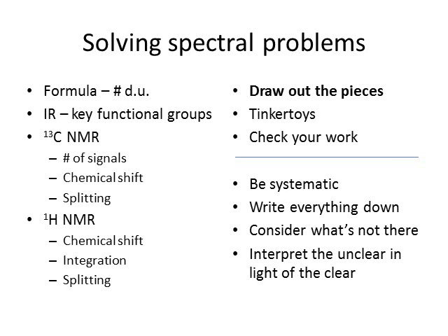Secondly, I look at the chemical shift. I look where those come. I note, oftentimes I'll write this directly on the spectrum, or I'll write it down in my notes to the side of the spectrum, which ones represent sp3 hybridized carbons, which ones represent sp2 or even sp hybridized carbons. I note which ones are carbons close to strongly electronegative elements.